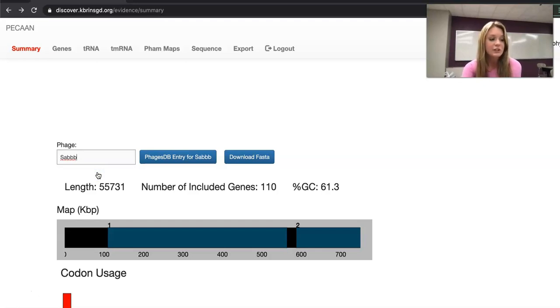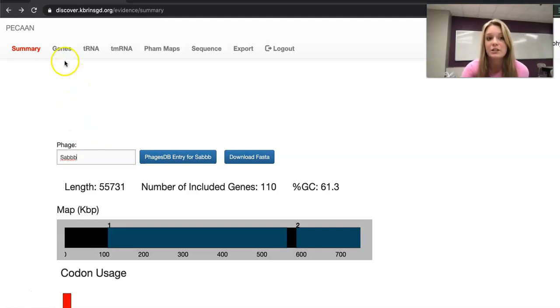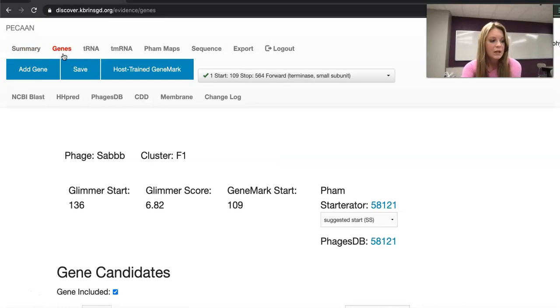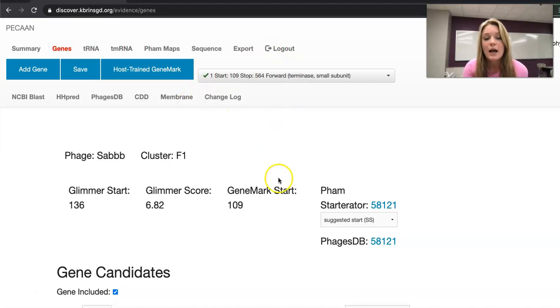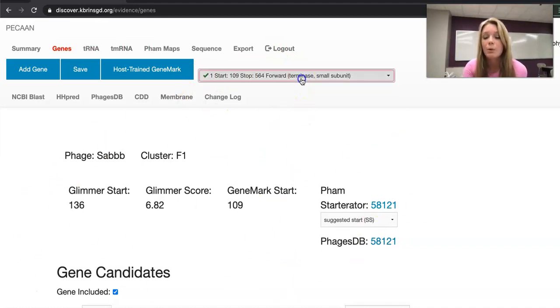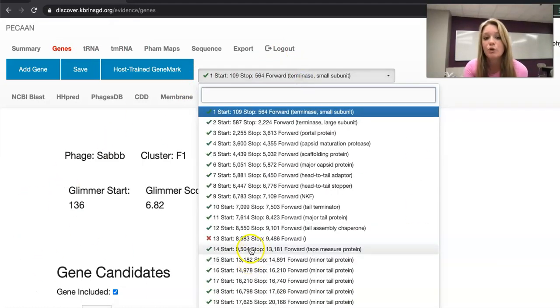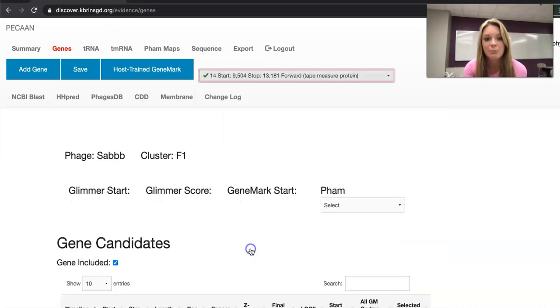After you select this page you're going to want to switch tabs within Pecan to view the page titled genes, which is to the left top of the screen. Now that you've gotten to the gene page, you're going to want to select the gene you're going to be working with. This is all the information for gene 1 but we want to look at gene 14, the tape measure protein gene.